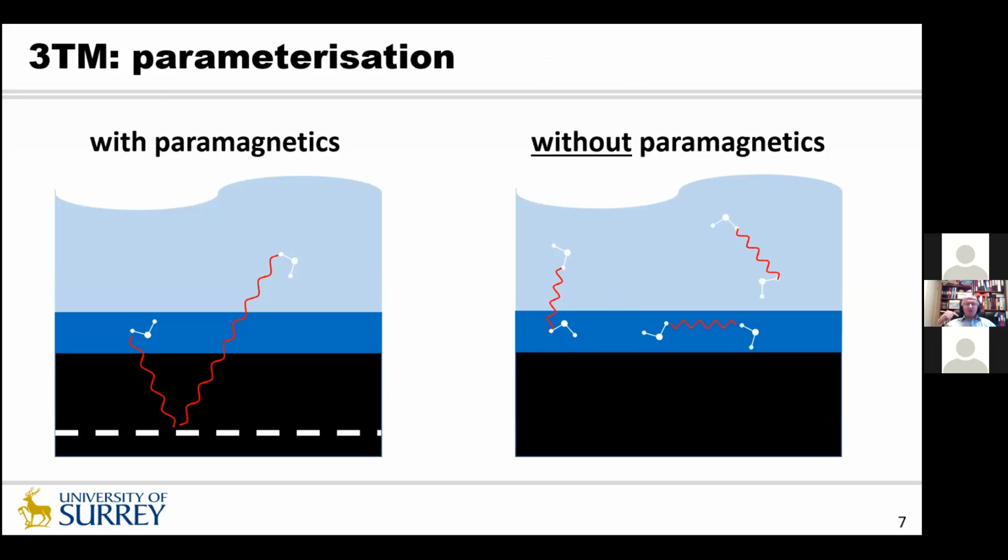Just before we move on to look at some fits, what we must do is hardwire a couple of parameters. These parameters are set based on molecular dynamic simulations in part, and in part by comparison with a set of fast field cycling data from Barbaron and co-workers published in 2003, that we'll spend a lot of time with over the next few slides validating the model.